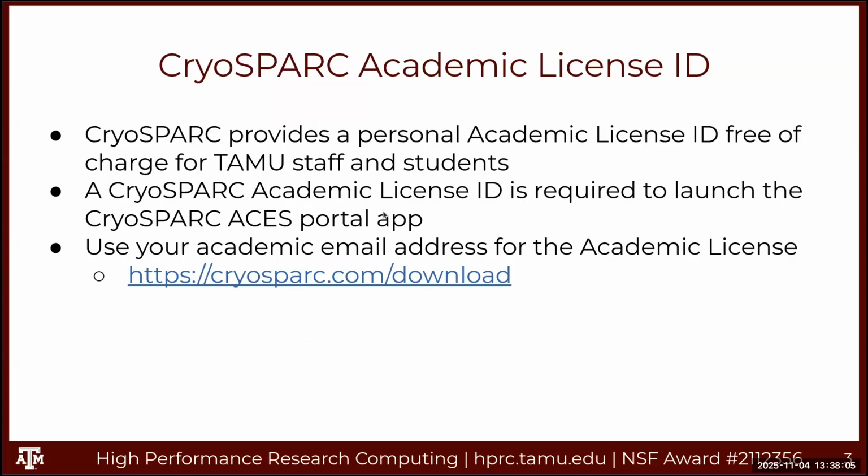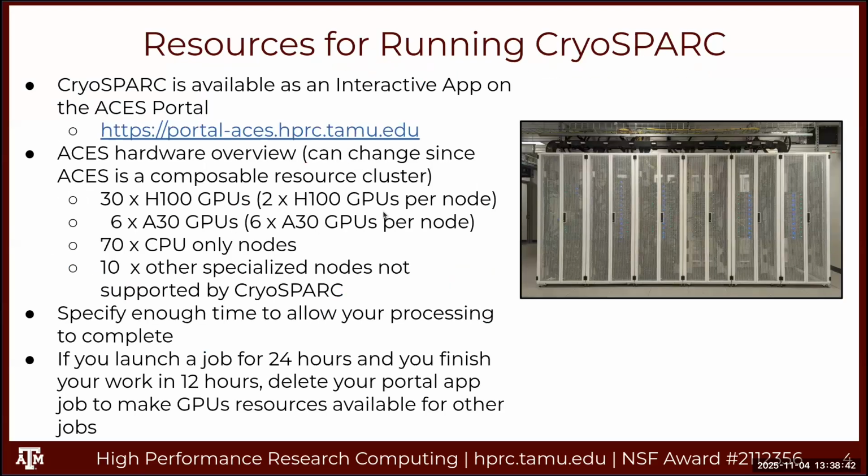All right, so the CryoSPARC academic license ID, you can apply for that. Use your university email, and you'll receive an ID from CryoSPARC within a day or two, and you'll need that to launch a session. You can only launch CryoSPARC one time. You can't launch two instances of CryoSPARC on ACES. You can only launch one. You could reuse your license. I've had mine for a number of years.